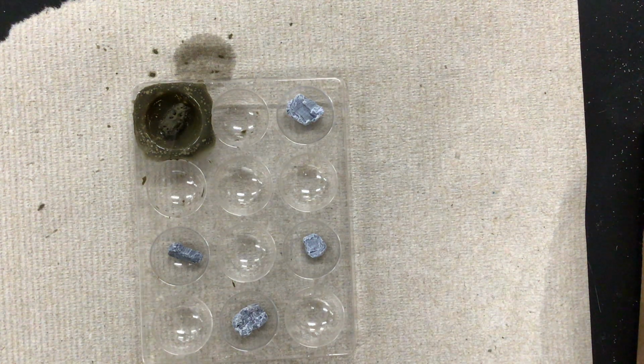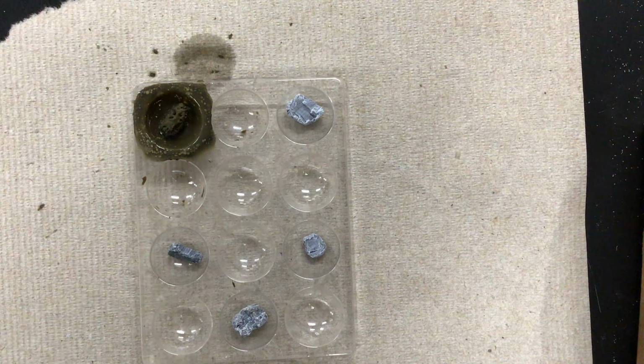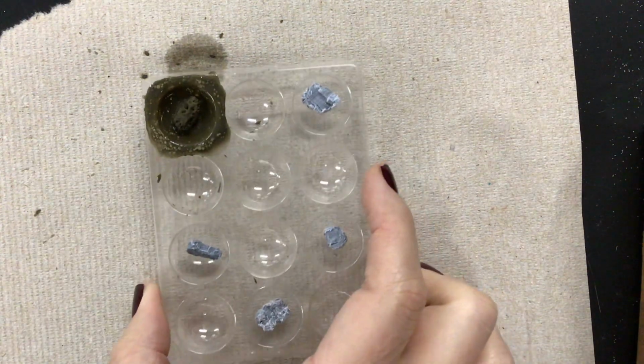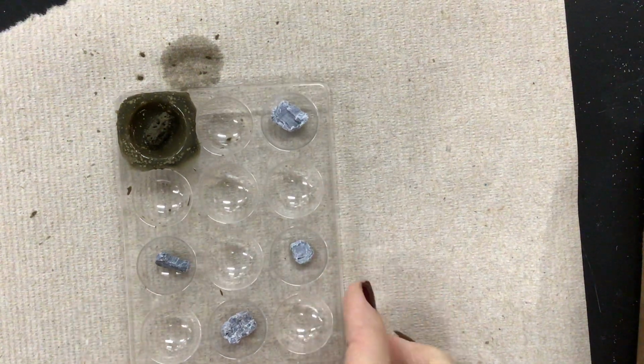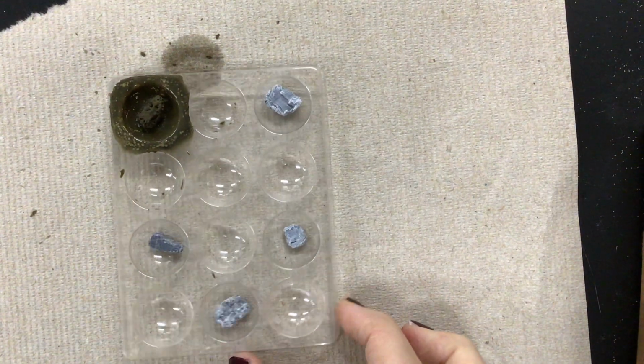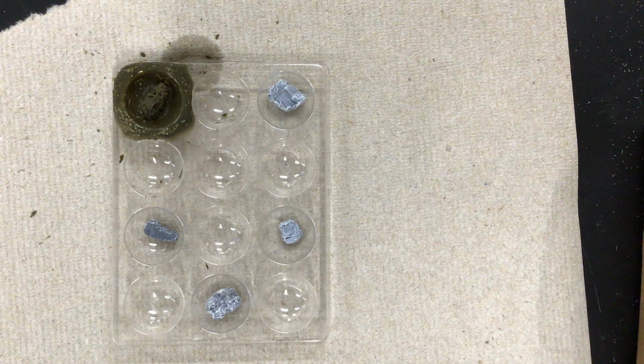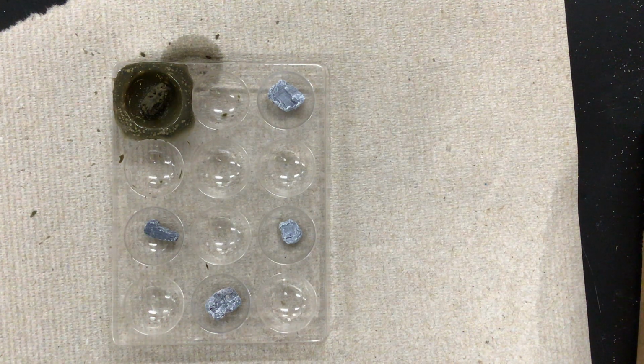So hopefully you guys can write down some observations about that. It looks like it's still kind of smoking a little bit. Okay. It's definitely hot on the bottom for sure. So there was a lot of evidence that a chemical reaction took place on that one. It got hot, it bubbled, it smoked, it fizzed, it popped. All the things happened on that one. That was pretty exciting. So let's do the next one.